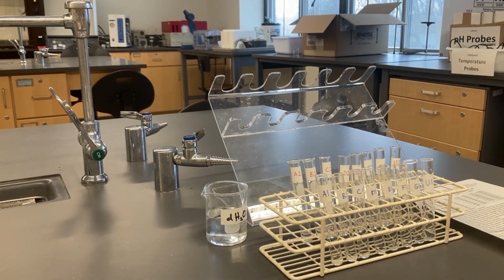Okay, now my A1s are going to be a little bit different in that they're going to mostly be different amounts. I added 500 microliters of solution 1, which is just the potassium iodate solution, for all of these. That's what's in there right now.